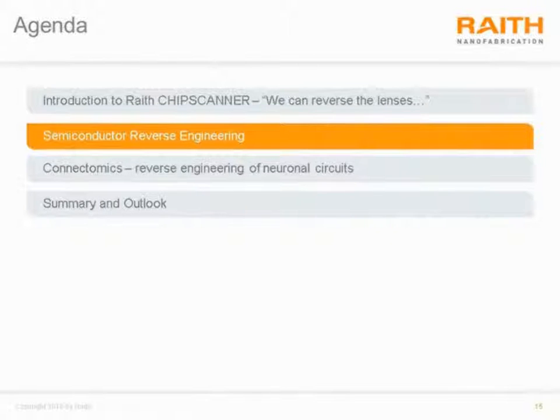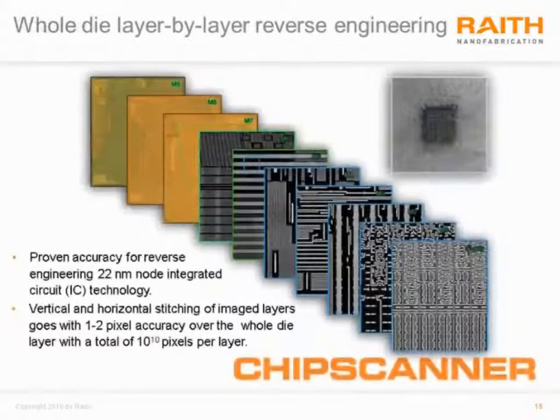So, the chip scanner has a few applications that I wish to share with you now. The first being semiconductor reverse engineering.